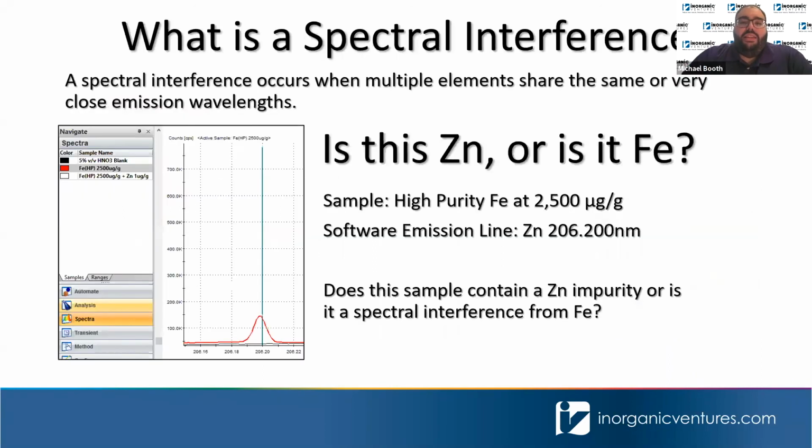Yeah, thank you, Thomas. So I apologize if you thought we were done talking about spectral interferences, but we are definitely not. Thomas did an excellent job going over how we were keeping in mind spectral interferences while we constructed the calibration curve. But we also need to talk about how we manage spectral interferences in our samples or your unknowns. So this slide is a classic example that we use in a lot of presentations and just to teach our staff as well.